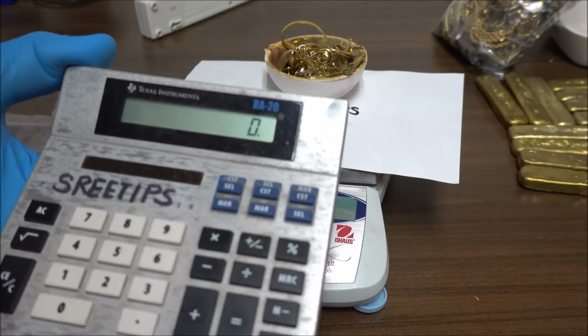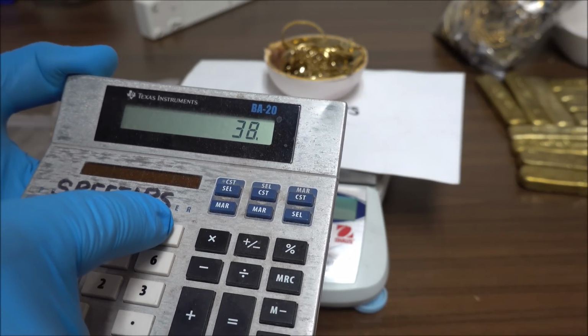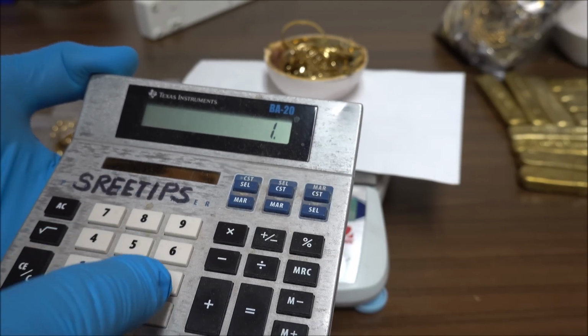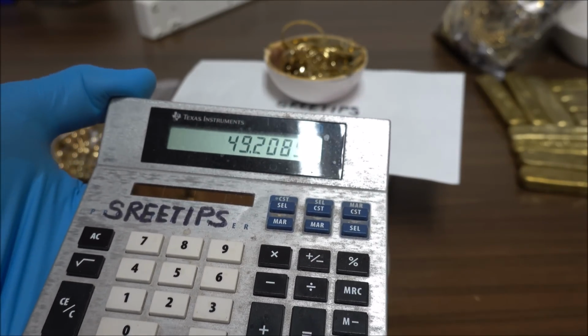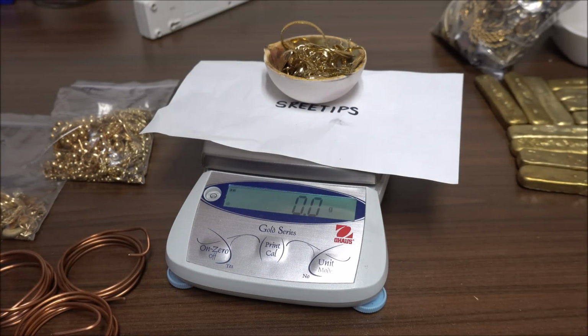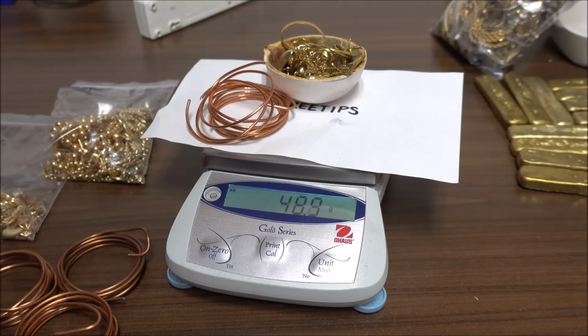All right, to see how much copper I need, I've got 38.9 times 1.265. So I need 49.2 grams of copper. All right, zero to scale here, and I off camera clipped up the right amount of copper that I'm going to need. That's 48.9. That's just fine. That'll work for this experiment.